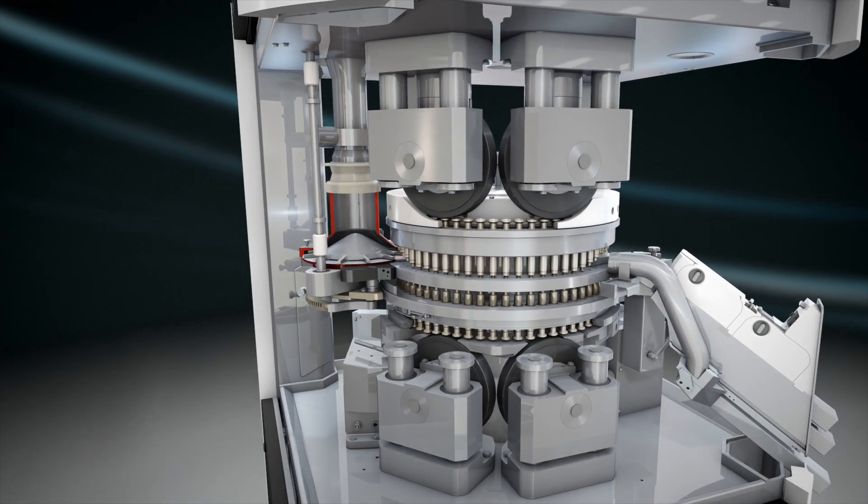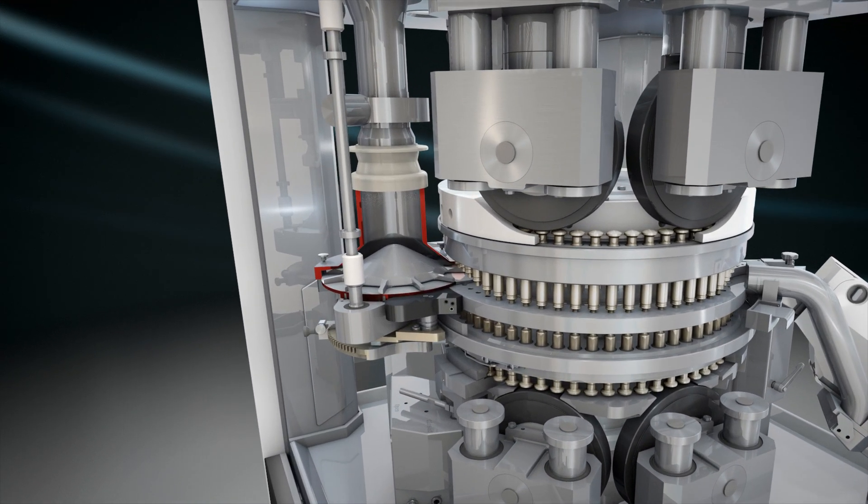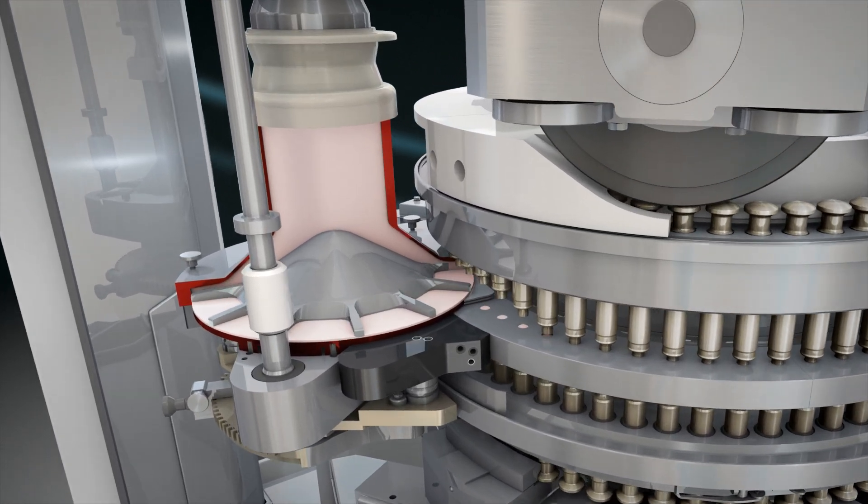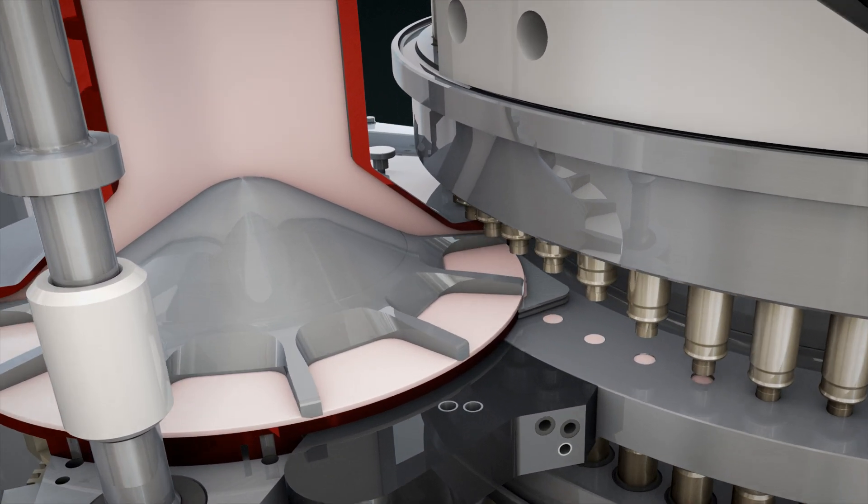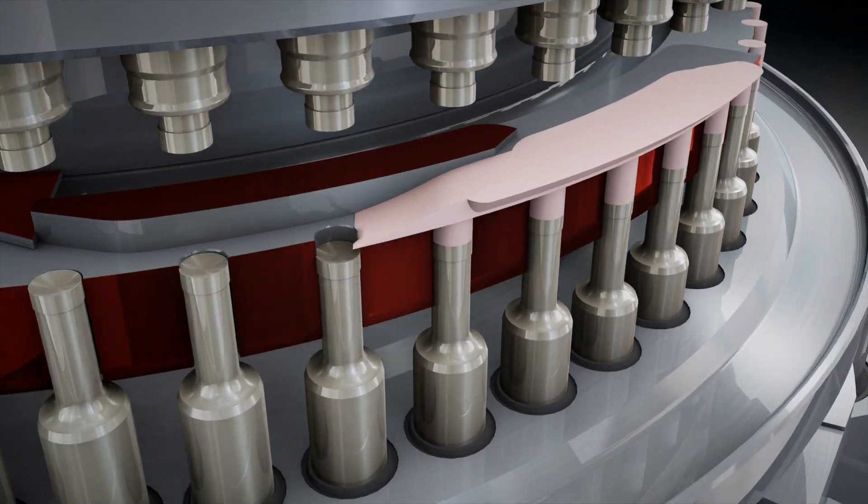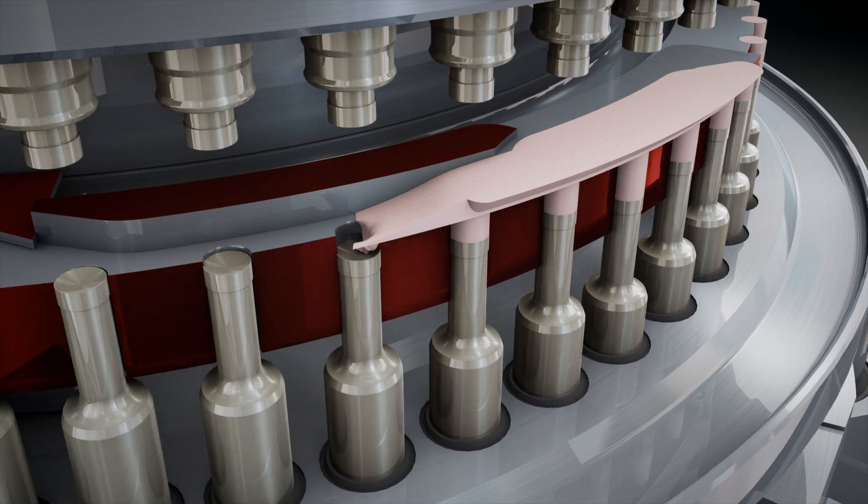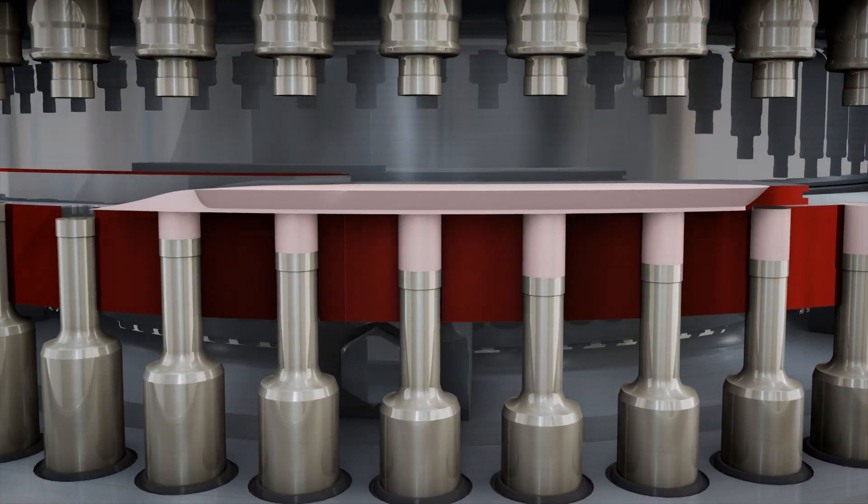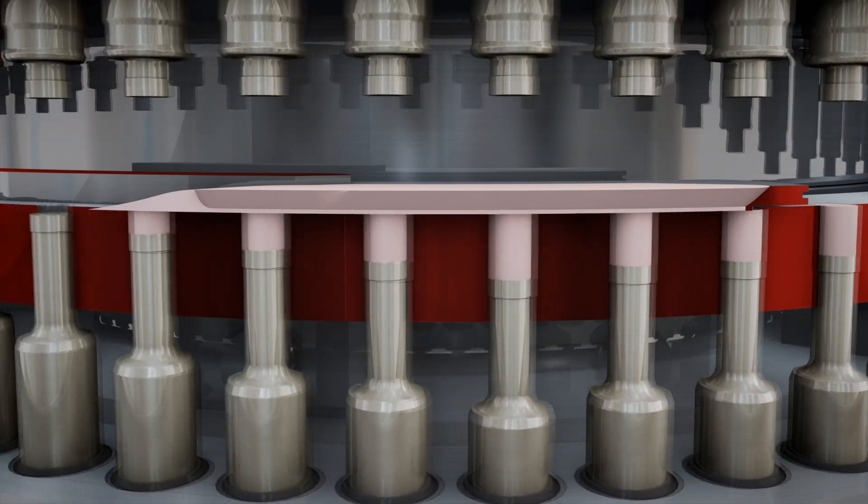The tableting process starts with filling the material which is to be compressed. The material flows through the hopper into the filling device, where it is led by the filling cone wheel into the segment bore openings. The filling is achieved by the lower punches moving down in the fill cam so that enough material can fill in the void.